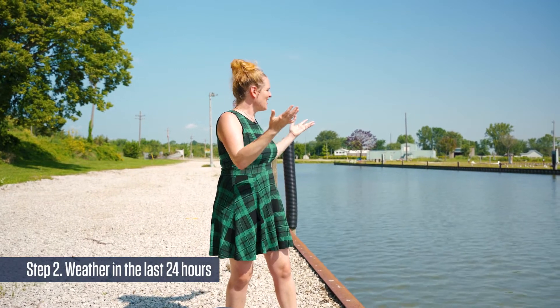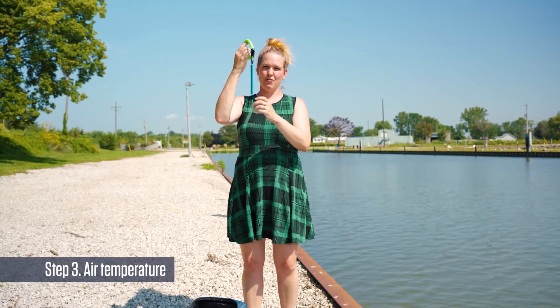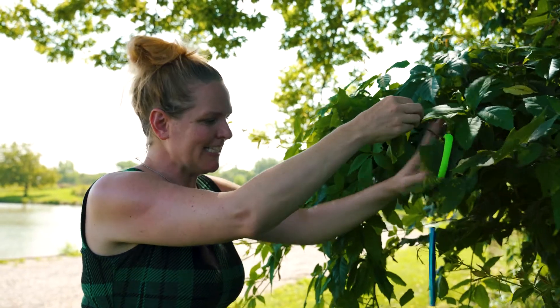The first thing you want to do when recording your observation for the day is to note the weather. As you can see here, it is very hot and sunny. You also want to note the weather in the last 24 hours — precipitation is so important for water quality, and we notice big changes after big rain events. We're also going to take our air temperature using the thermometer, and hang it in a shady spot in a tree at least a meter above the ground while we do the rest of our tests.